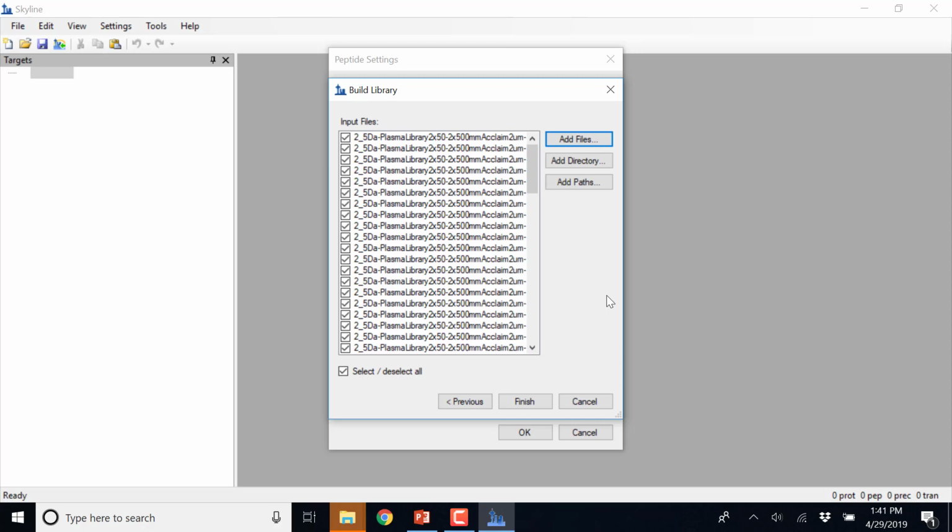I think you have to unzip those. If you can open up that directory with Windows Explorer, just unzip it. Yep, unzip it. And then there'll be a break.